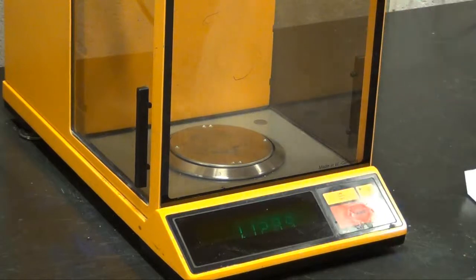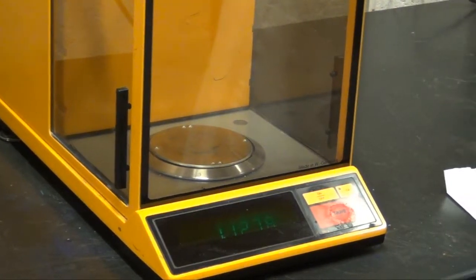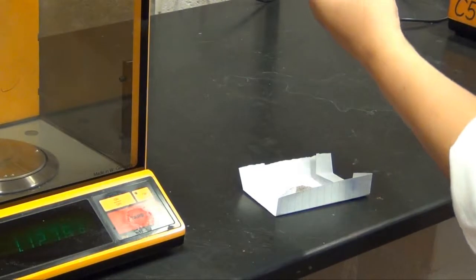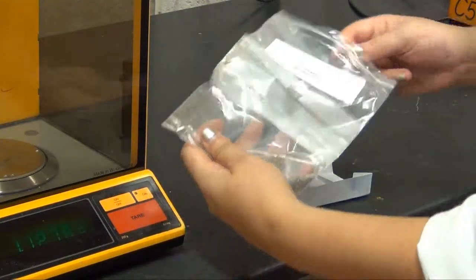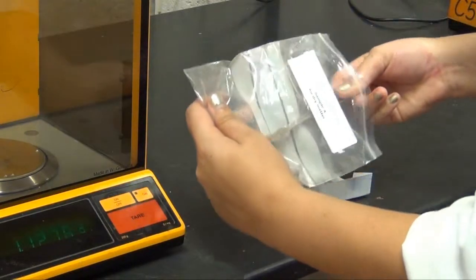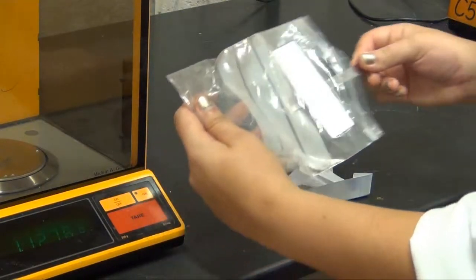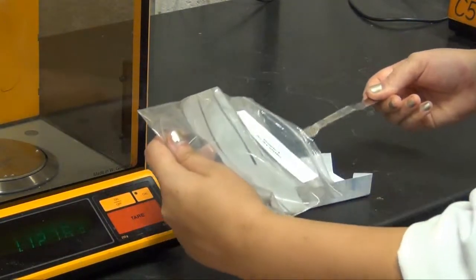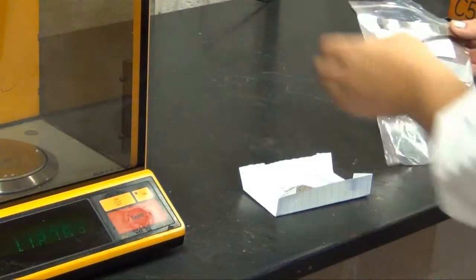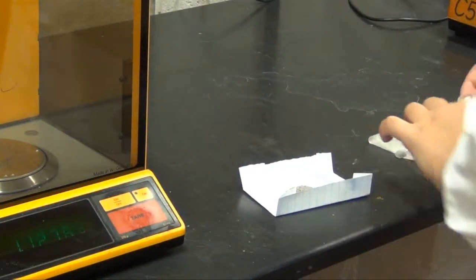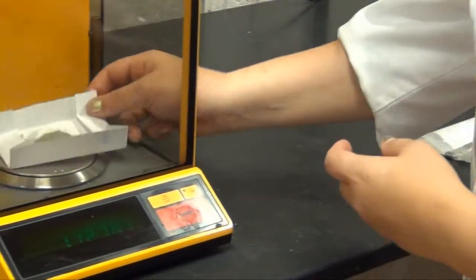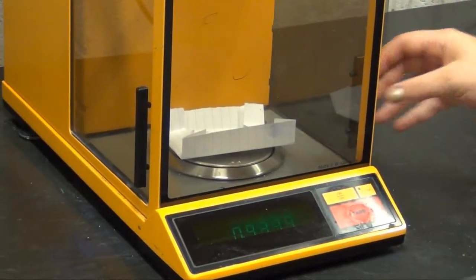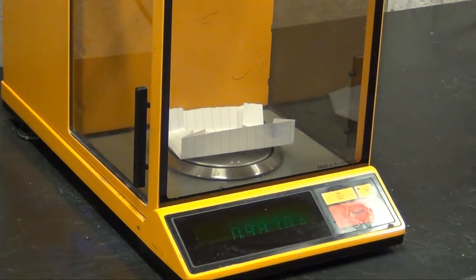Every time the balance is left, the door is closed.